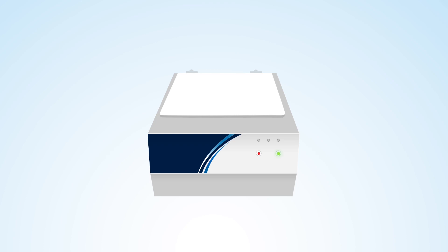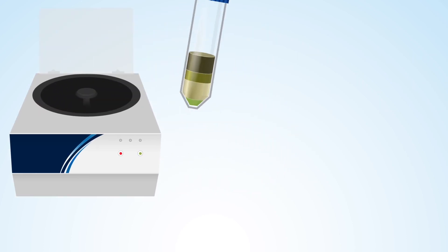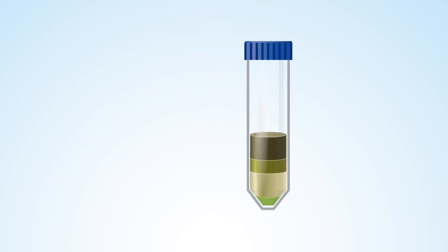After the sample has spun down, take a look at your sample. You should see four distinct layers. From the top down, there's the supernatant, the sample solids, water, and excess extraction salt.